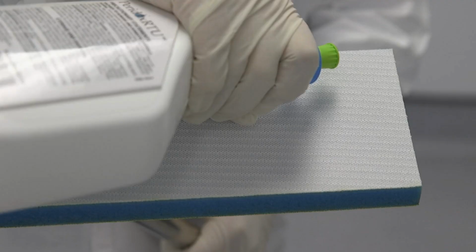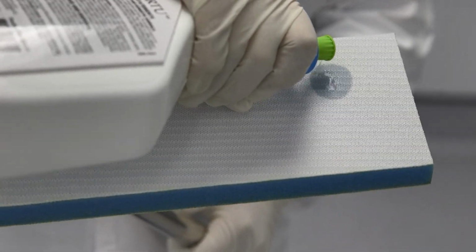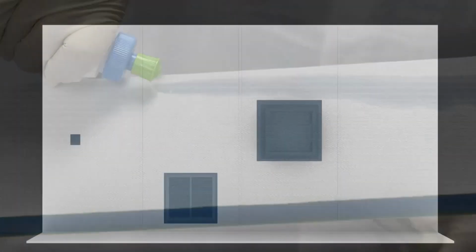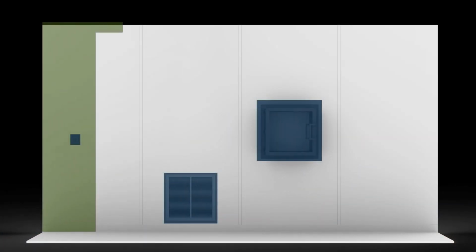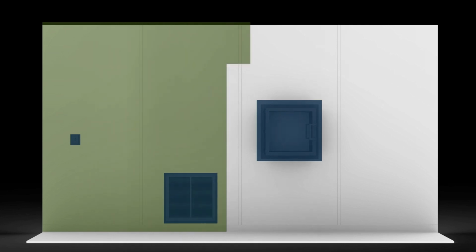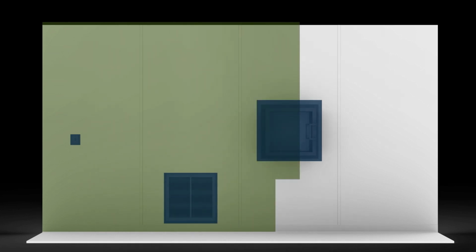So once we've done that, now we can get our big paint roller, our wall mop, that we're going to use to paint the disinfectant up on the wall. Oop, I keep forgetting I can't walk in front of the projector. Using unidirectional, overlapping strokes, moving from the cleanest to the dirtiest. Don't miss a spot.